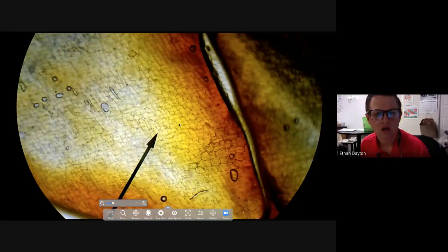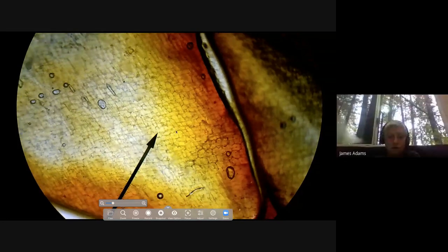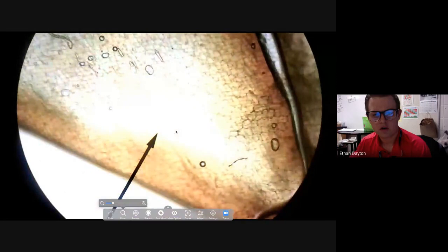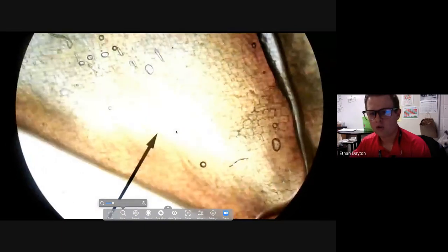The difference I see is that the other cell, the cheek cell, they're in clumps. Okay. Like there's pieces where they're scattered, sure, but this one is just whole. What about if I say the shape of these cells? How are they different? They're more squarish. Yeah, more rigid, more rectangular, more uniform.